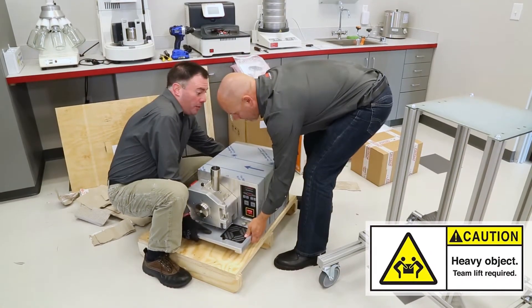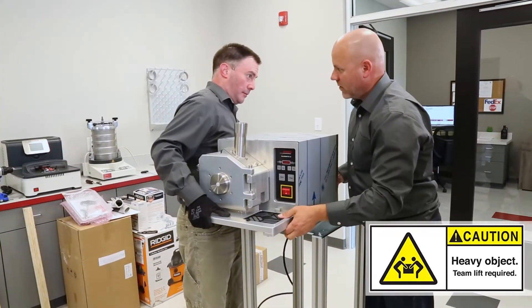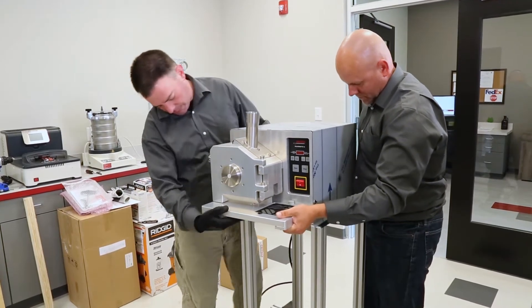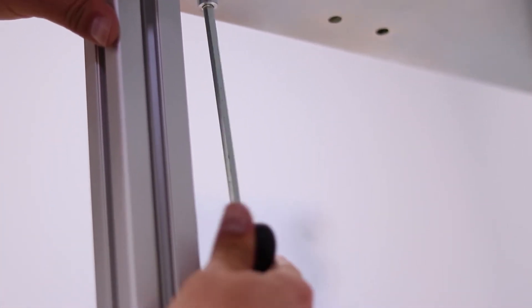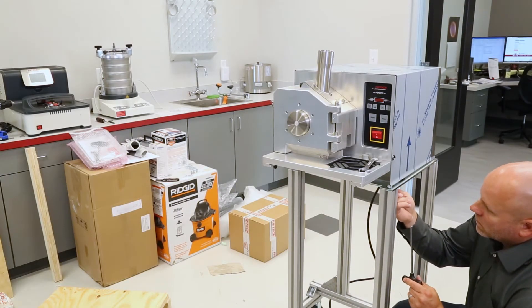With two to four people, lift the mill from the pallet base up onto the stand. At least one person should hold the mill at all times while it is being fastened to the stand. The P19 mill is heavy, weighing over 120 pounds. Please do not attempt to lift the mill on your own.